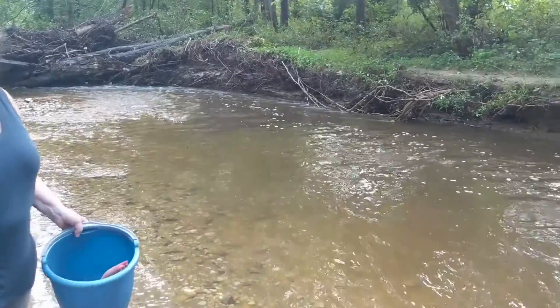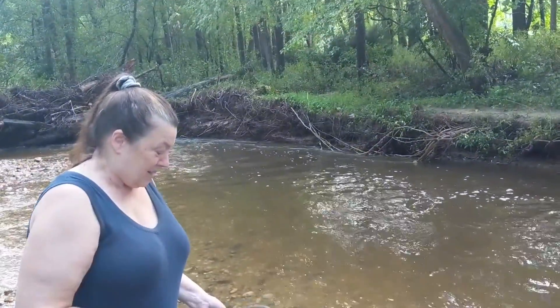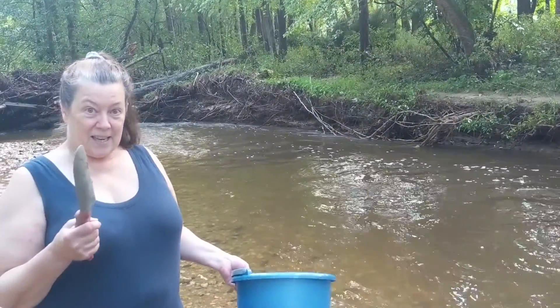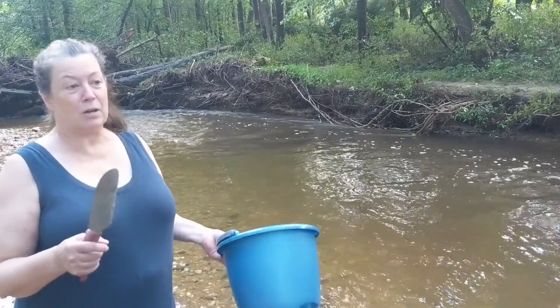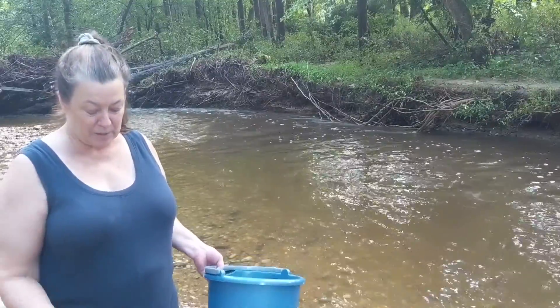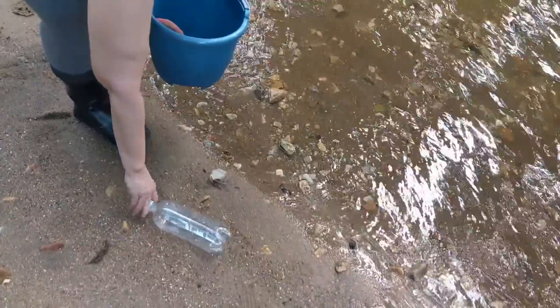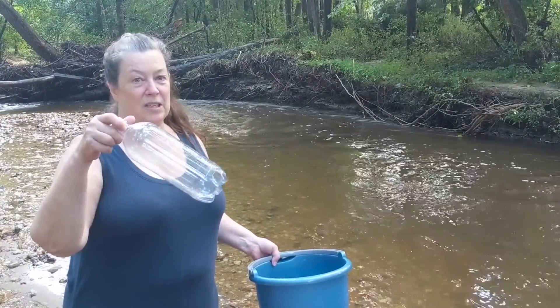The water level is pretty high — it's been raining a lot. I have a bucket and a trowel. You can use a tablespoon, a paint stirrer, anything that you can use to scoop up some sediment. And then I have an empty one-liter bottle that we're going to collect some fresh water in also.